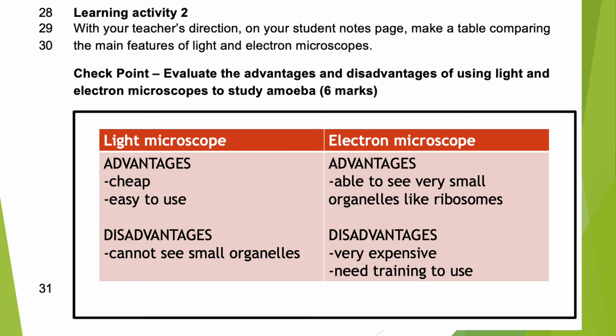And they actually need extensive training to use. You can't just go up and press a button and expect to get an image out of it. You need to know how to use a microscope like that. You need to know what program to use, how to use that program. There is just way too much stuff that you need to know in order to use an electron microscope.